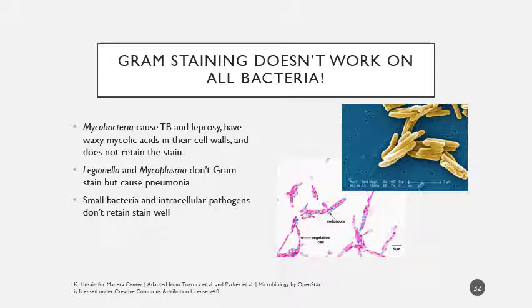So again, gram staining is not the best diagnostic tool there. Gram stains are also differential, but they don't tell us anything about the differences within a single cell. You can distinguish between two different cells, but you can't tell anything about the unique structures within a single cell. That's why we need structural stains.